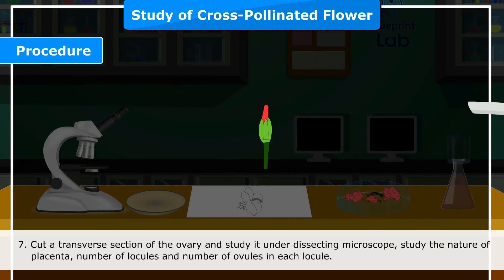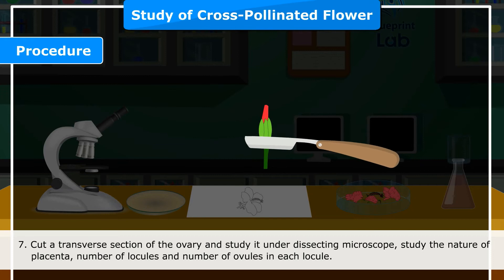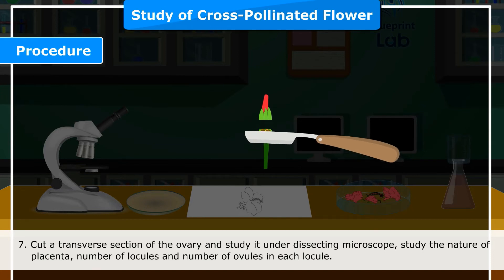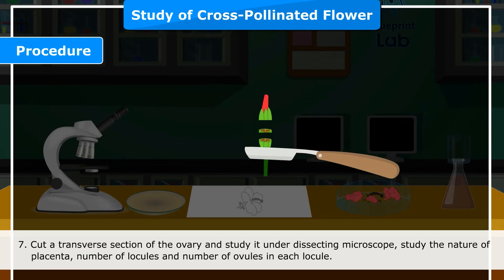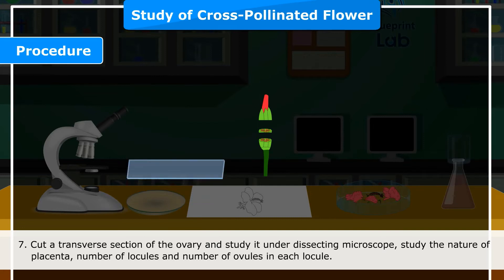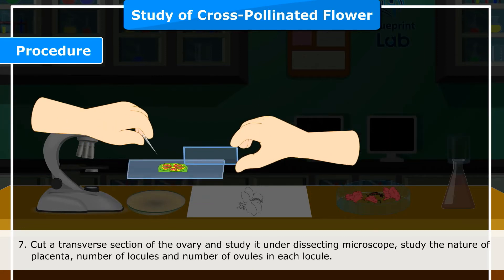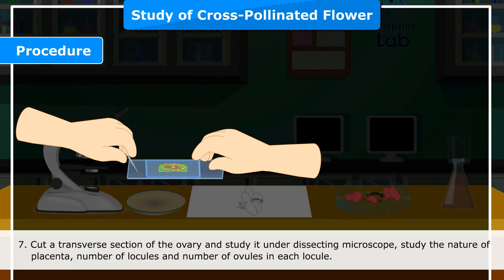Step 6 — After removing petals, androecium and gynoecium become visible; display them. Step 7 — Cut a transverse section of the ovary and study it under a dissecting microscope. Study the nature of the placenta, number of locules, and number of ovules in each locule.